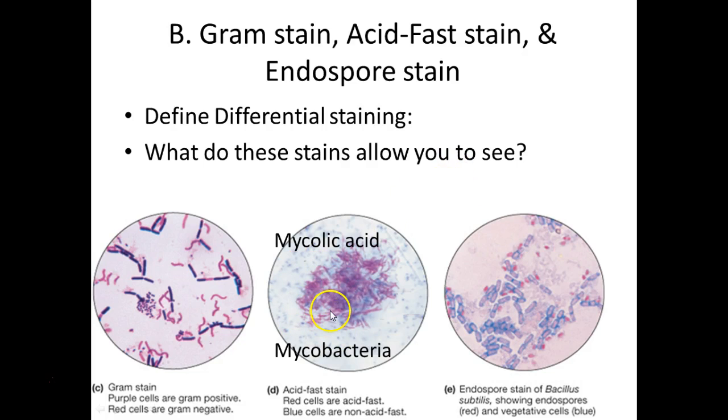So for acid-fast staining, this isn't as widely used as the Gram stain because one genus of bacteria stains acid-fast, and that's Mycobacteria. That's because they contain a substance known as mycolic acid in their cell walls. And this allows the carbolfuchsin, the dye, that even when we decolorize with acid alcohol, and that's where it gets this name of acid-fast, these guys do not lose that color. It stays. So in this case, when we say fast, we're meaning it stays put. It's not going anywhere.